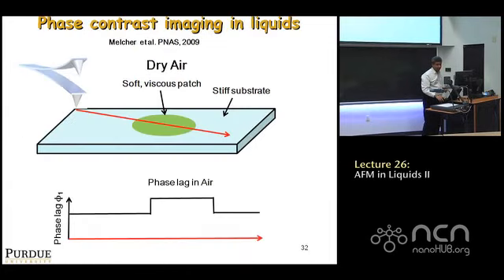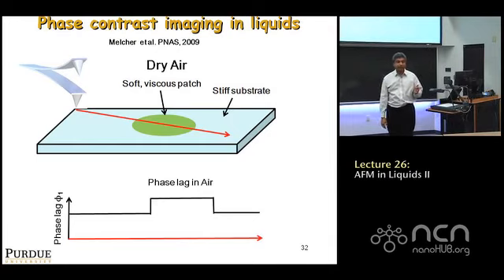Now we come back to the question that Francisco was asking regarding the difference between this ringing and energy dissipation. Remember, we derived a long time ago that the sign of the phase lag is connected to energy dissipation, correct? So that's the dissipation and virial that you derived. And that's correct, even in liquids, that relationship is always correct.